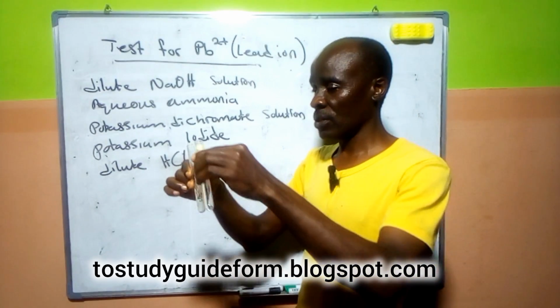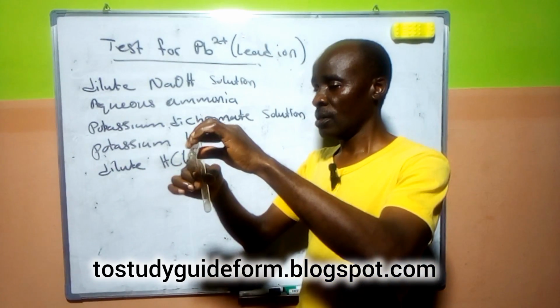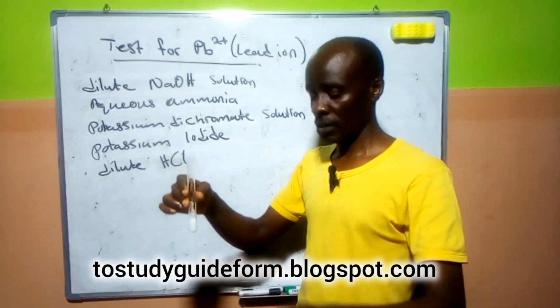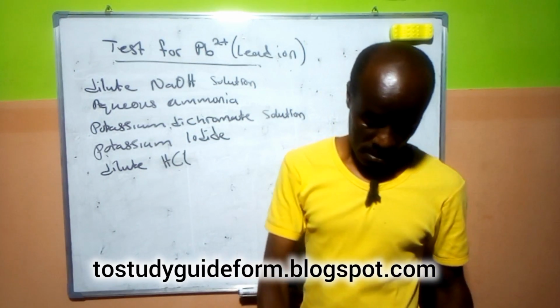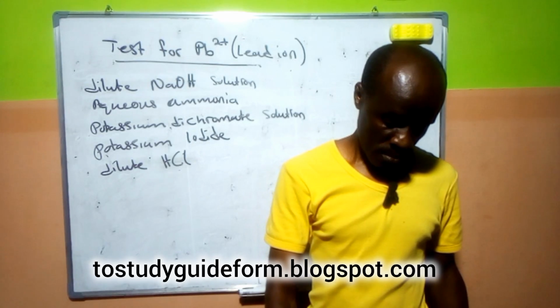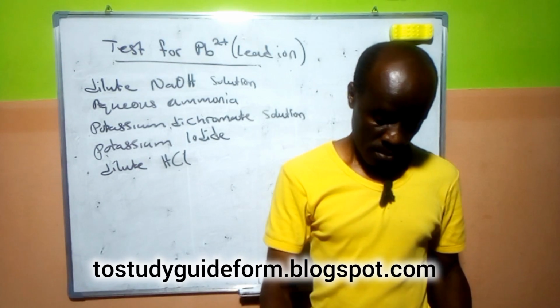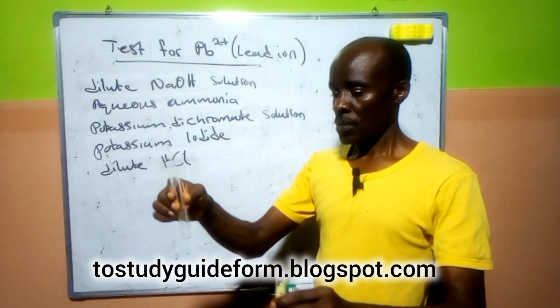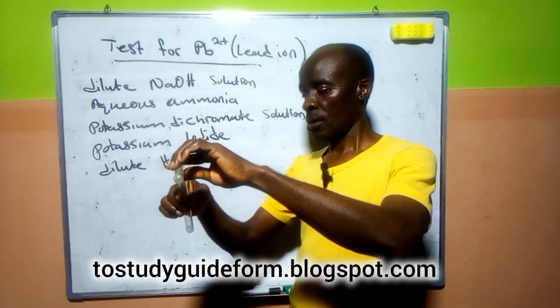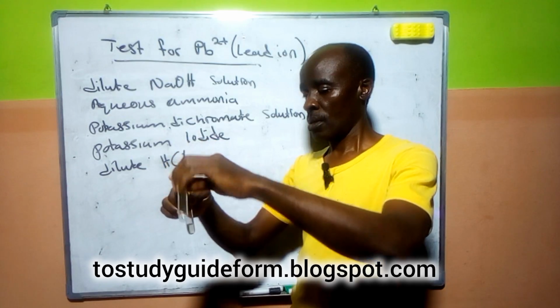So now we have a little quantity of it. We add sodium hydroxide in excess. Okay, all right.